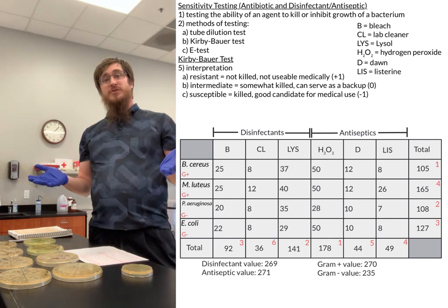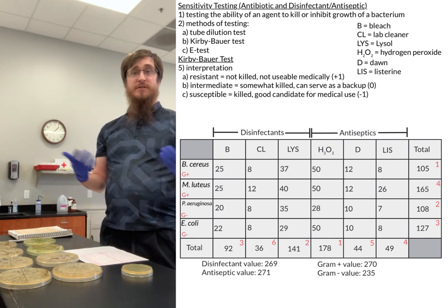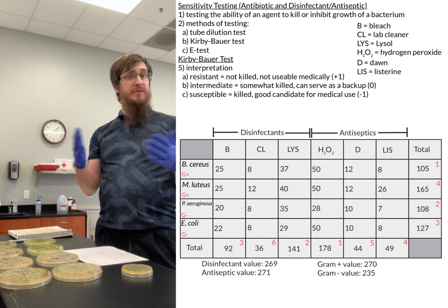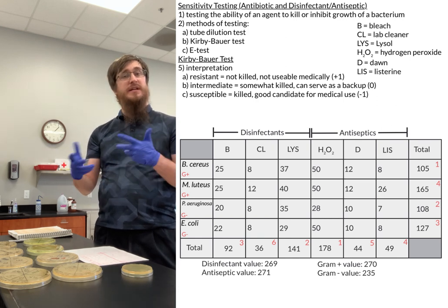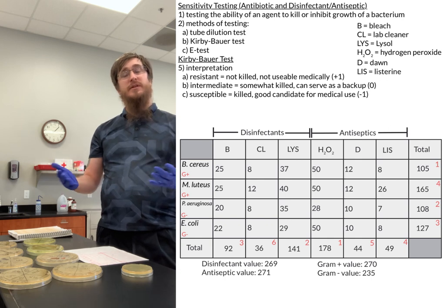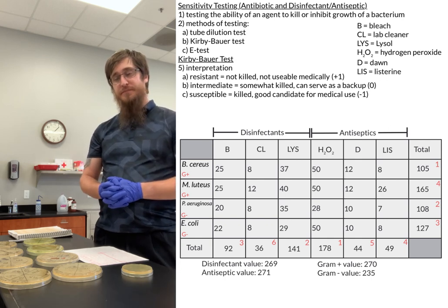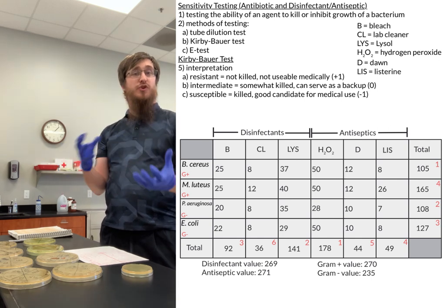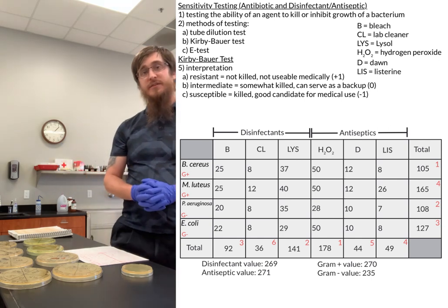So depending, of course, on which specific type of cleaner you're using, which disinfectants, which antiseptics, you might get varied results. And this is where the data can be a little bit difficult to interpret, because it really depends on the specific items that are used. But really, that kind of covers the way that we interpret the antiseptic and disinfectant side of things.